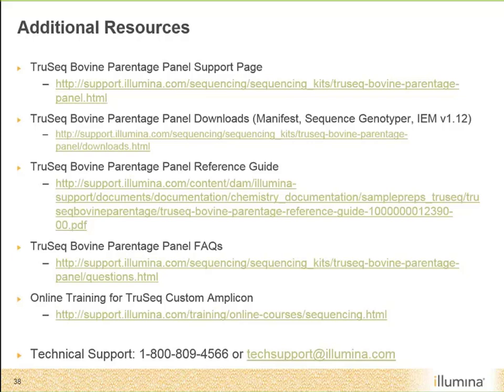And also if you want a little bit more visual as far as the TruSeq Custom Amplicon workflow that the TruSeq Bovine panel follows, we do have some great online training that covers the TruSeq Custom Amplicon workflow if you wanted a little bit more detail.